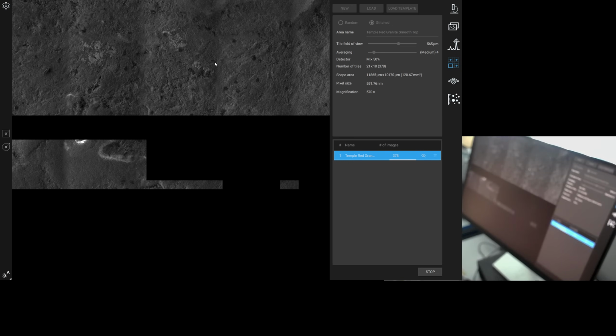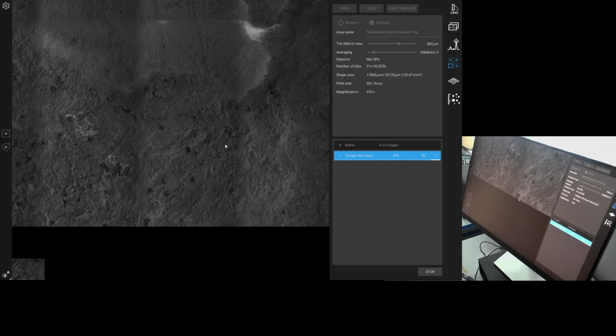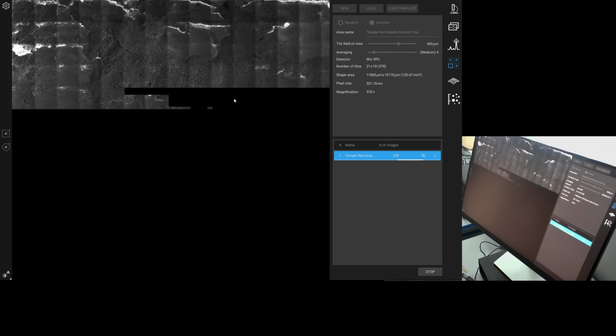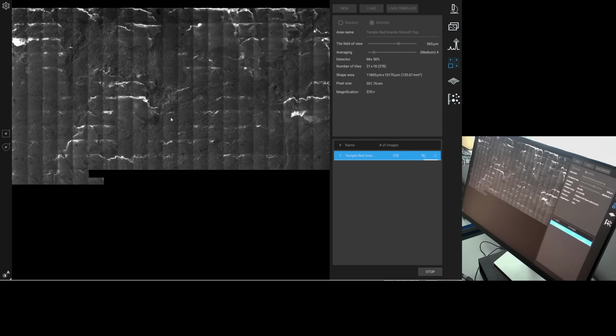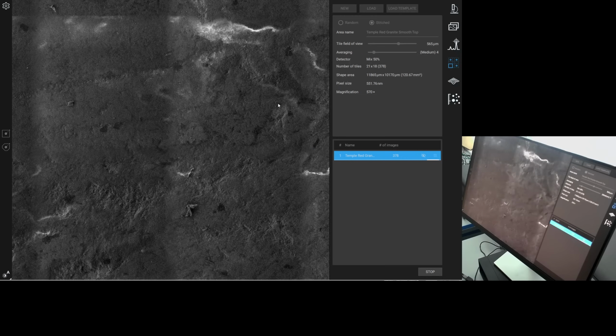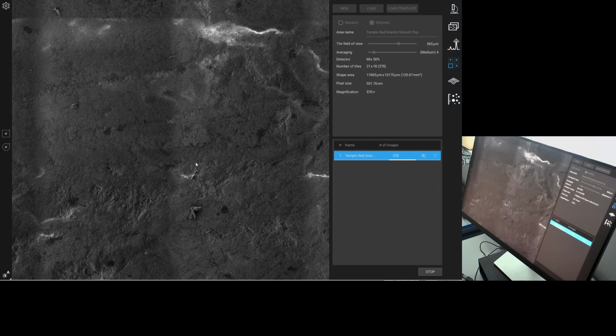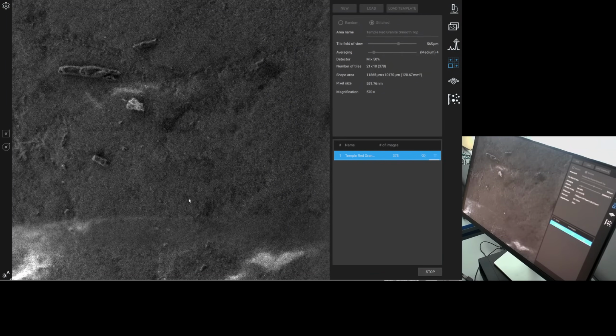So you can see how, because this charges, it gives a less than ideal view, but still it's something. You can see the maybe silicon dioxide rich areas charged. So this isn't actually lumpy, it's just because of the way that the scanning is going on.